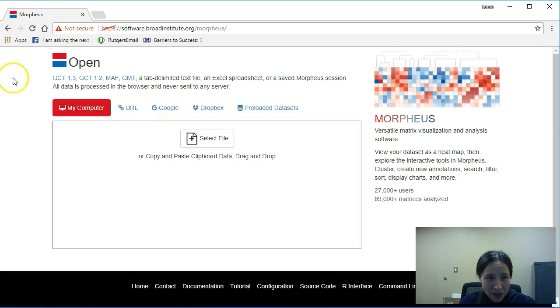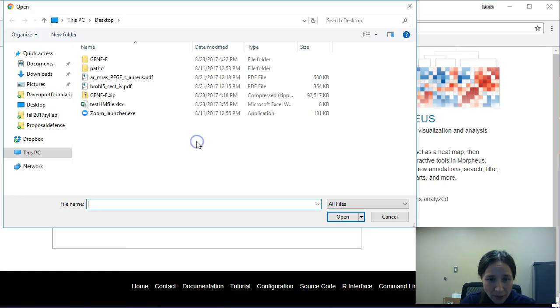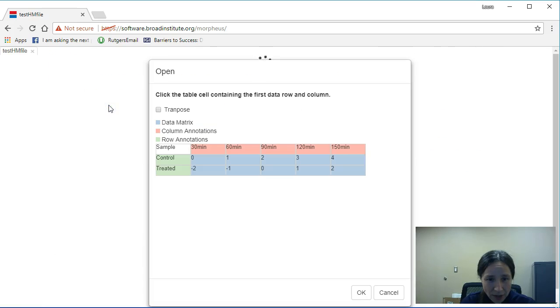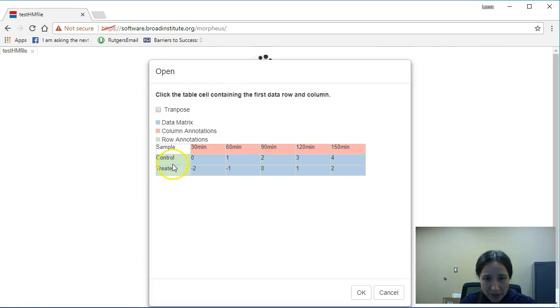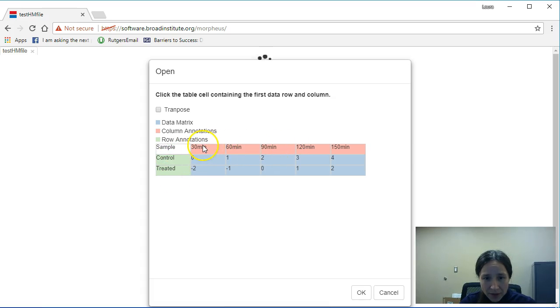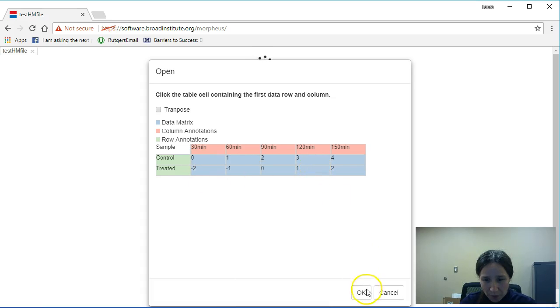Now we should have that Excel file ready to go and go ahead and upload it. You'll see your data within this table. Your rows are in green, your column annotations are in peach, and then any raw data in the matrix is blue. So go ahead and click, okay?